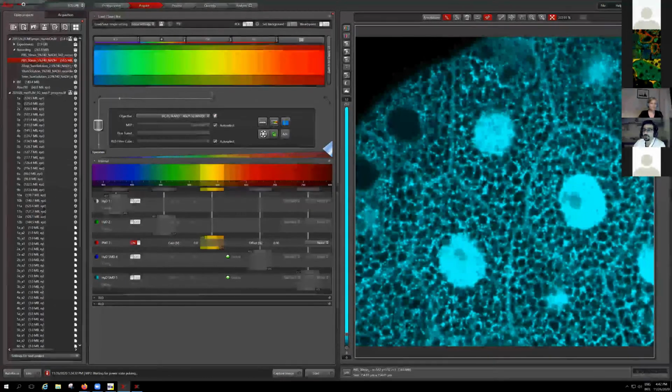So there is another question from Delgadil, a chemical question: cell fixation with PFA, for example, can change the lifetime of NADPH. We have talked about that. NADPH is a fluorescent molecule at the end, and changes in the microenvironment of the NADH change the lifetime of NADH.